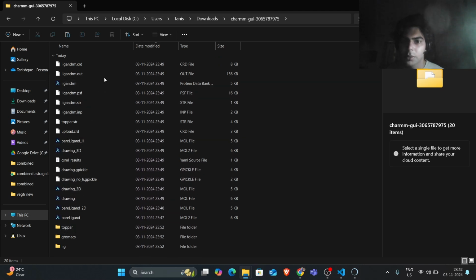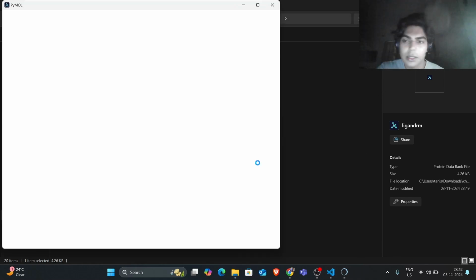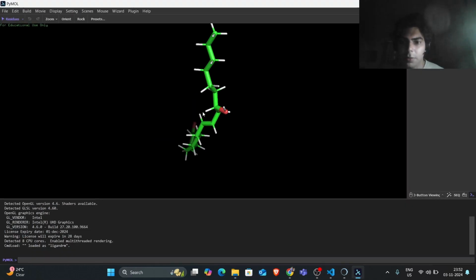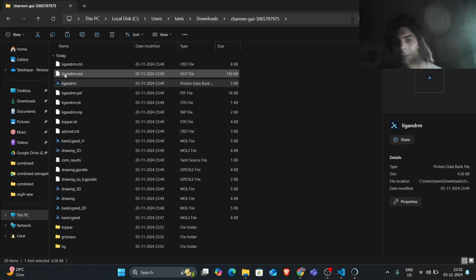if you see, we have a separate PDB file for our designed ligand in which we removed the extra bond from carbon. It won't make a difference to you when you visualize it, but it makes a lot of difference when you actually put it up for creating a system for a simulation. So I need this ligand file to be with the protein file.